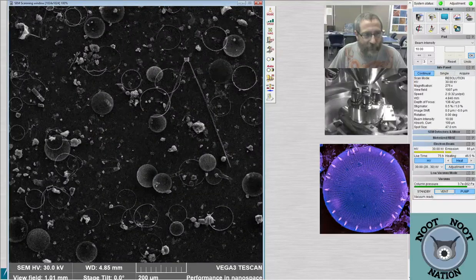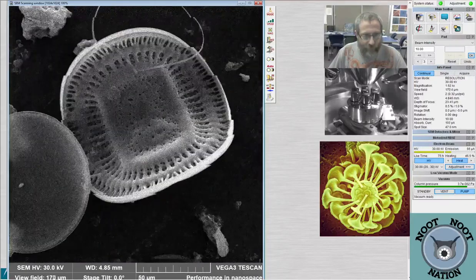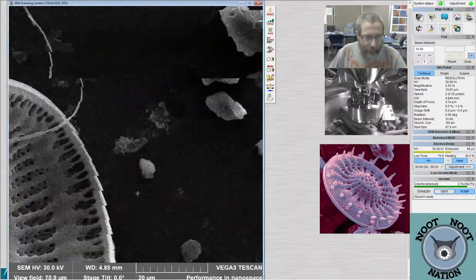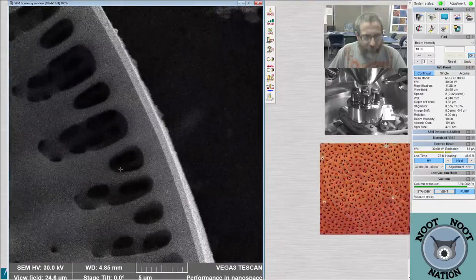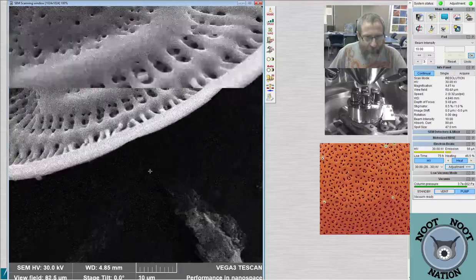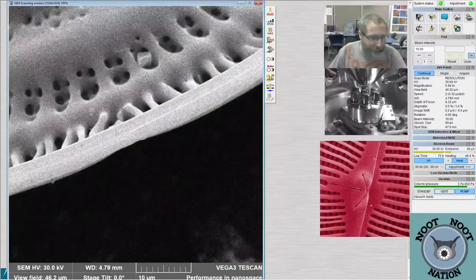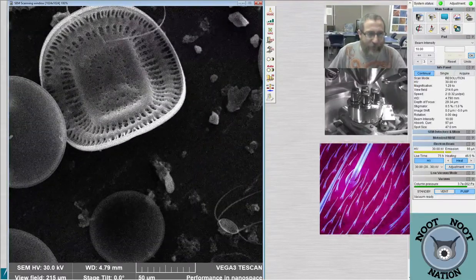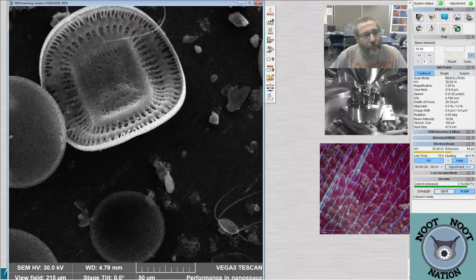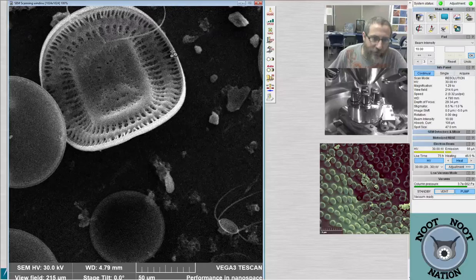So the raphe that goes around the outside edge of that, does it have ends? Like, is there an obvious spot where they poke in or start? Or does it just wrap around kind of smoothly? It has an end. Don't drink in an SEM, folks. It does have an end. We might not be able to see it. My guess is it would be either where it's a depression or where it's high, but we're looking at the outside of the diatom, and so the raphe wouldn't be visible. Maybe this is the inside actually, or the raphe would be on the other side. The slit would be on the other side. We could see it if we could look inside this little structure right here.